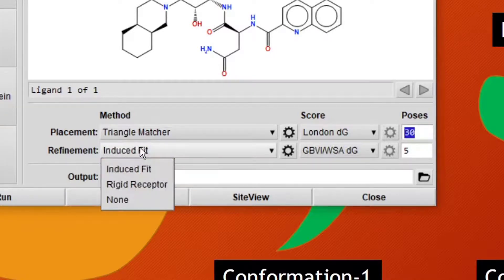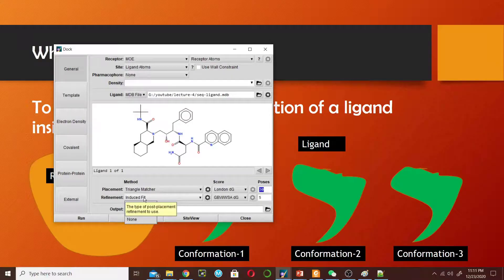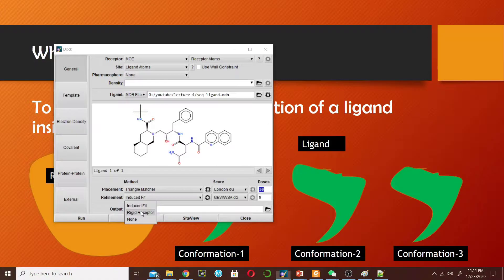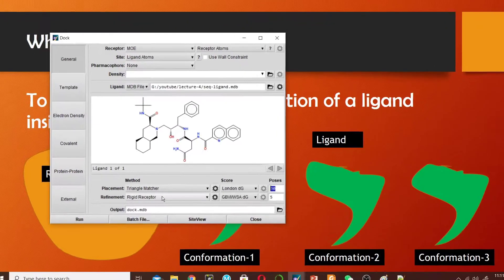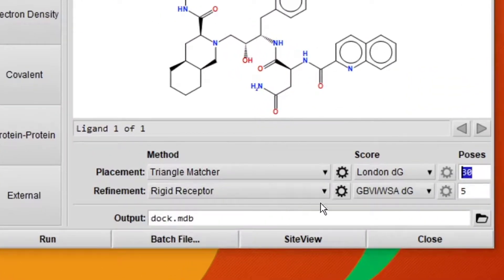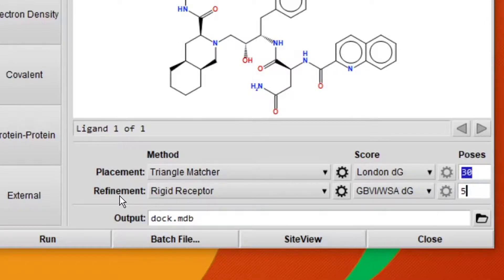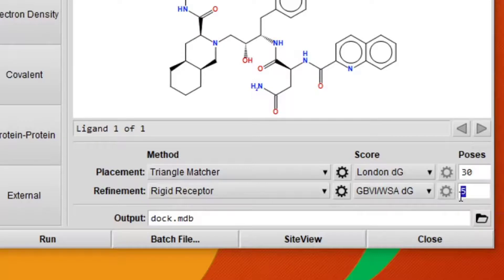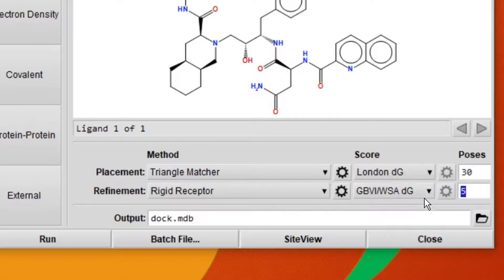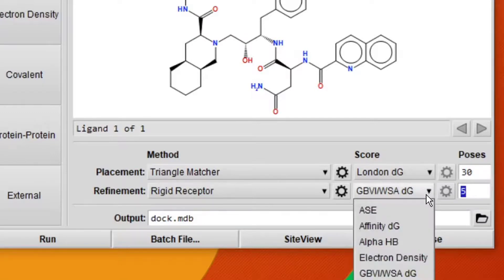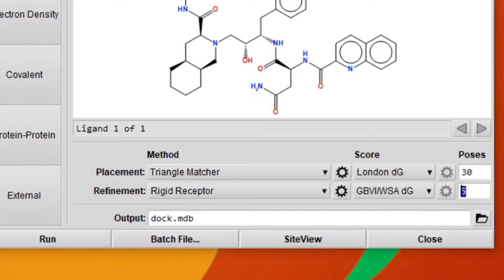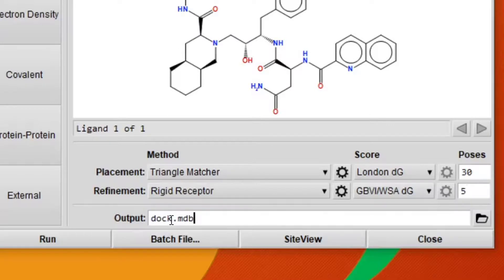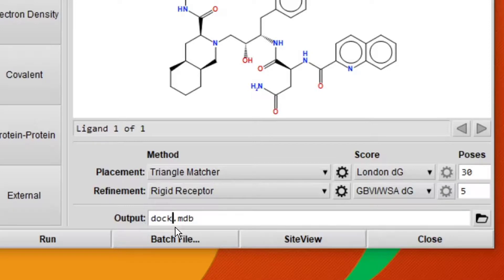From 30 poses, this refinement method will give us 5 poses with the best score. This time the scoring will be done by GBVI/WSA dG scoring function. This is the output file name. You can change this name to any name - I'm going to dock the second layer, so I will write 'sick'.